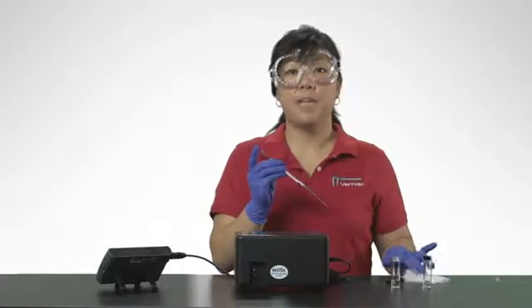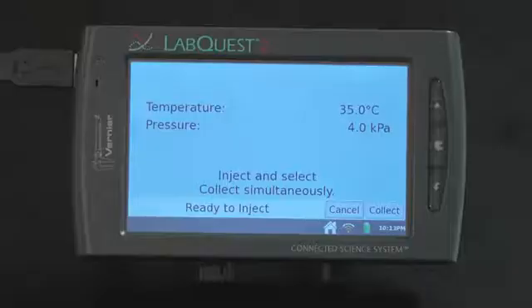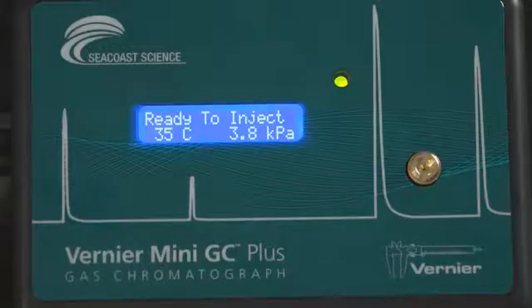When the Mini-GC Plus has reached the correct start temperature and pressure, the message reads inject and select collect simultaneously, and the LED on the Mini-GC Plus is green.